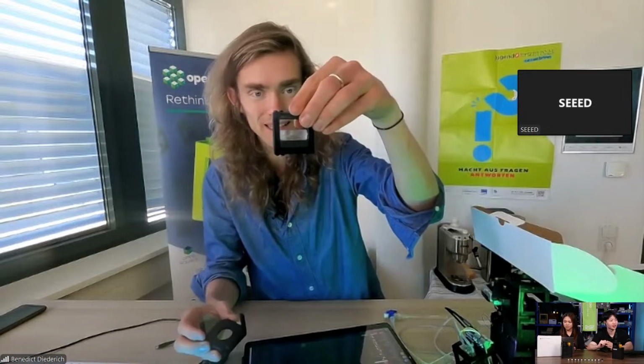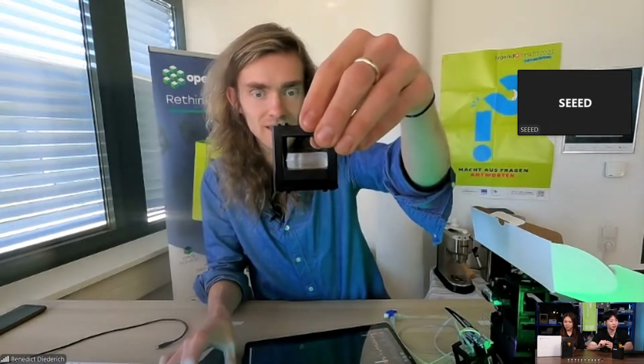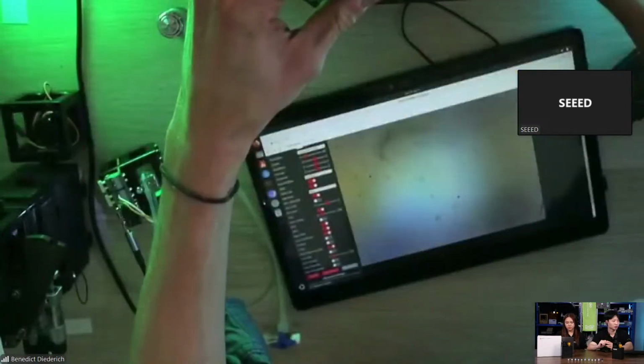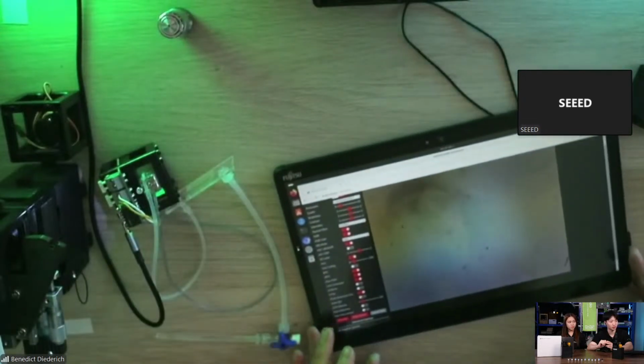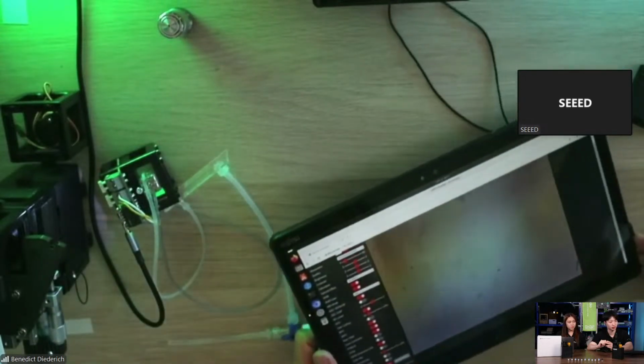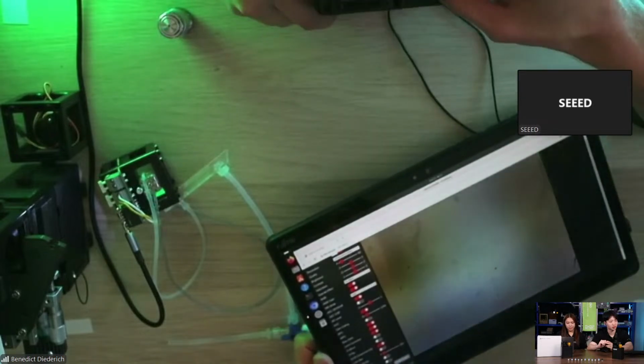And then you open this thing and we have something prepared here. It's actually already inside a little cube. This is just a little chamber where we have some water in there. And then we are going to add this to the Xiao microscope. So then you see that here again. Okay, and then we have to focus. And this is what I mentioned previously.